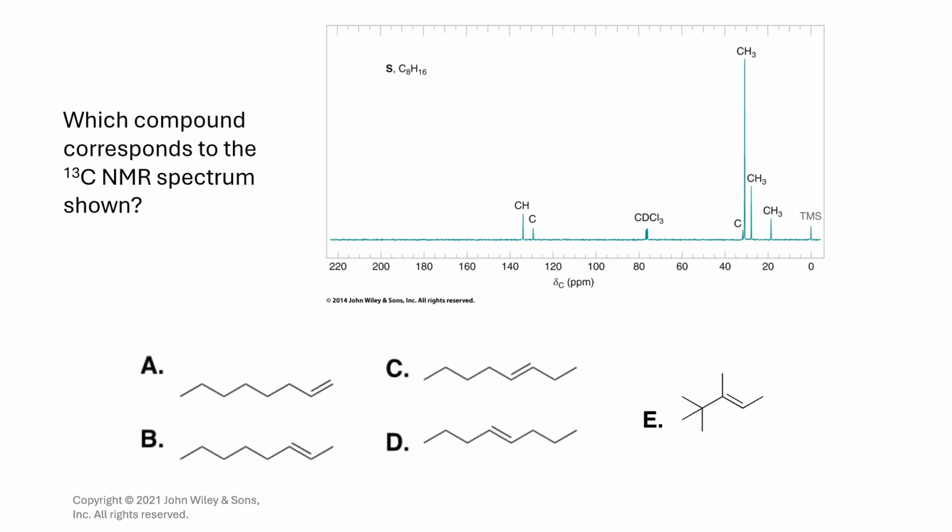When it is a CH, you determine that using DEPT techniques. So what we're looking at here is a molecule that has 3 methyl groups that are different. 3 types of methyl group. In this C, with no H's, 2 quaternary carbons. That's your deuterated chloroform. That in fact is just a solvent, so we don't take that into account.